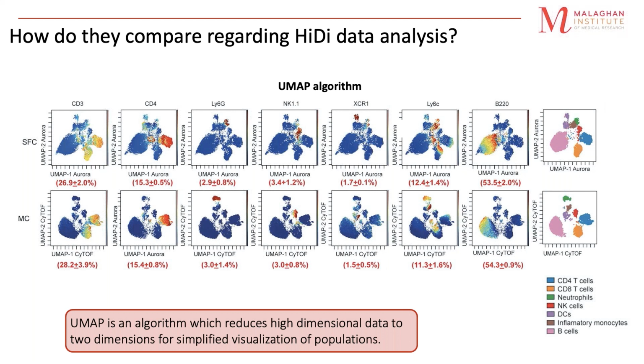We needed to run 2 different analyses because the parameters from CyTOF and the Aurora were too different, but despite this fact, we were quite surprised to see that our UMAP maps looked very similar, and that we could identify the same populations in both datasets. We could also identify some differences. For example, XCR1 positive events are defined better in the data collected from Aurora, but overall, the analysis looked very comparable.